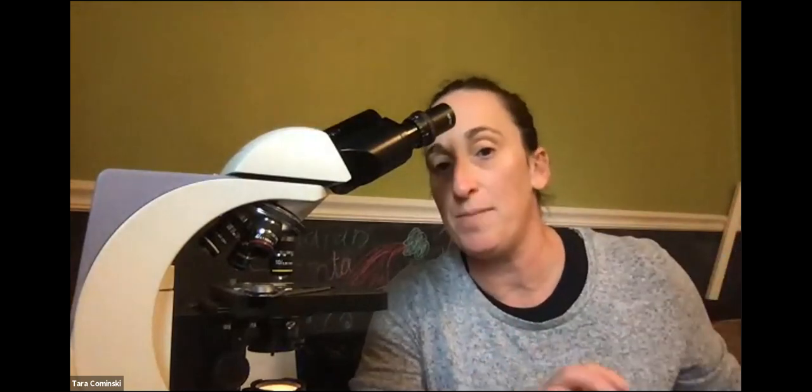All right, so now I just flipped it to the 10x. The low power is 10x. What is the total magnification if you're using the 10x? What about if you're using scanning? If you forget what the magnifications are, you go back a couple pages to the beginning, page 19, where it told you to write down the magnification of the objectives, okay?